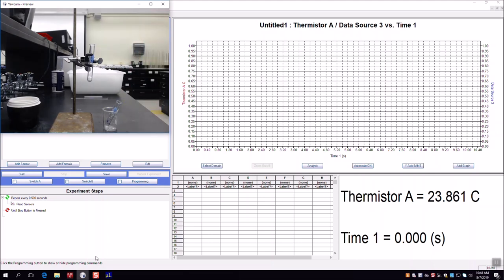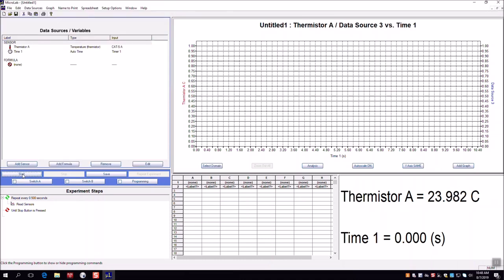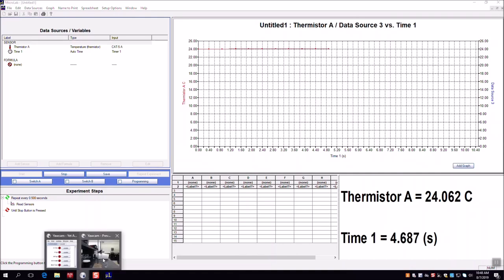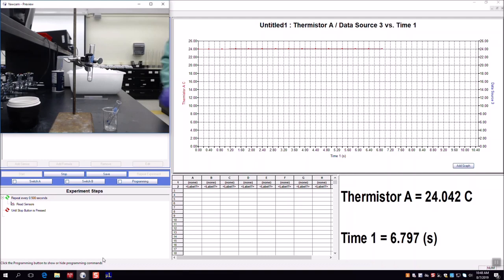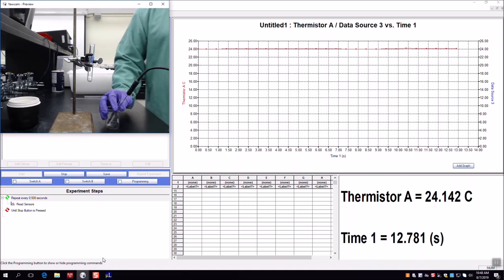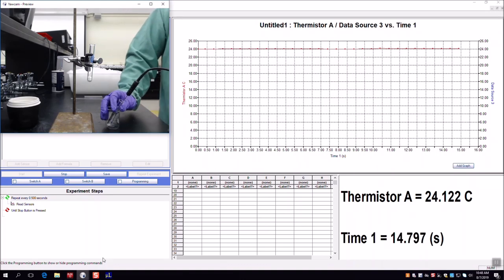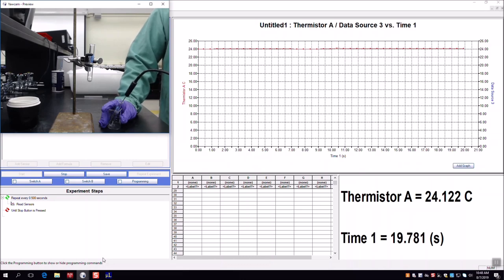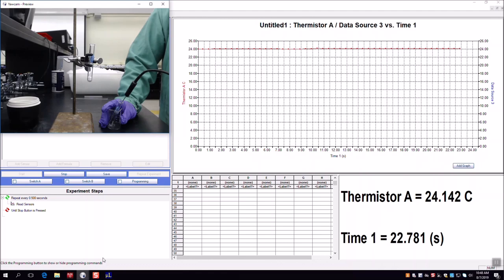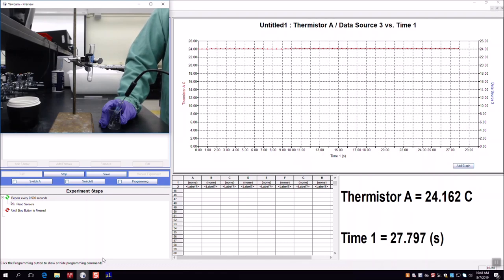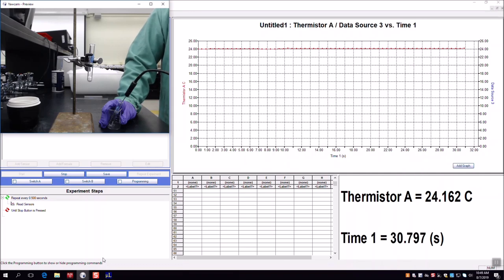I put an empty test tube in a beaker, placed both on the balance, pressed tare, then added 5 grams of water to one and 0.5 grams of calcium chloride to the other. I'm going to put the thermistor into the water test tube and click start. The points that appear before the experiment are not the ones we want — we're just establishing a baseline temperature for the water.